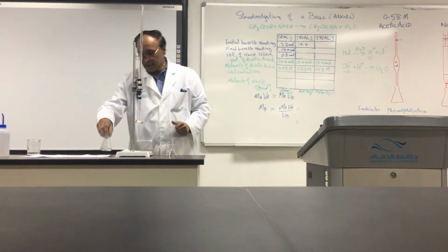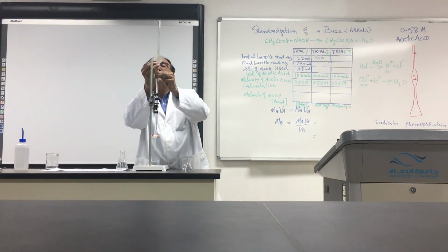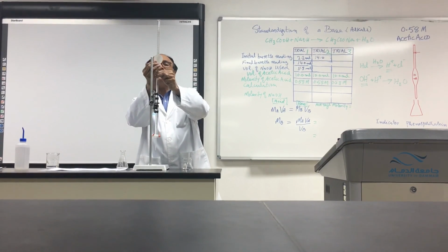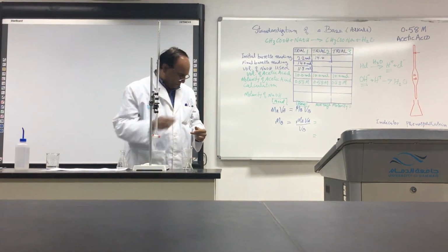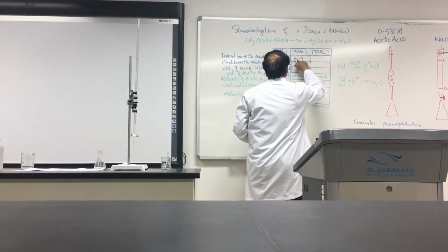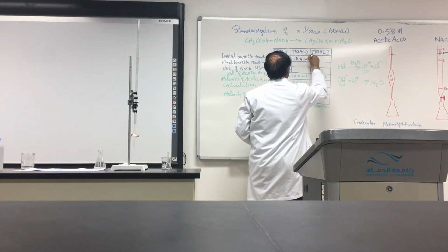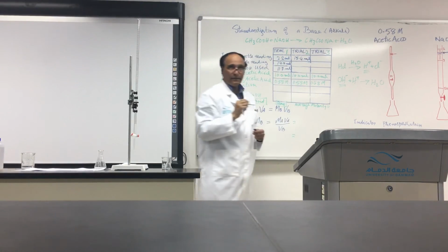So, what is the reading of this one? It is now 15.4. Okay, boys? Did you understand?